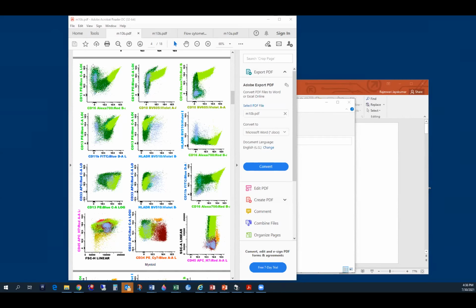So here is how the granulocytes usually mature. The fluorescent green is your neutrophils, or the most mature spectrum of the granulocytic series. At the start here is where the promyelocytes sit. So promyelocytes here, myelocytes here, metamyelocytes here, and then granulocytes here. Promyelocytes have 13, they lose 13, and then the myelocytes and metamyelocytes start gaining 16, and granulocytes have 13 and 16. So that goes in the pattern of a Nike swoosh.